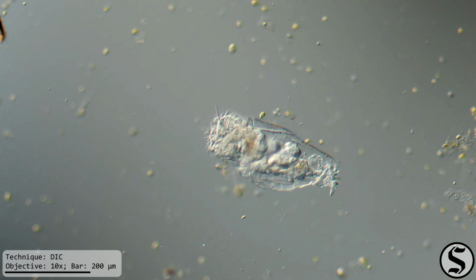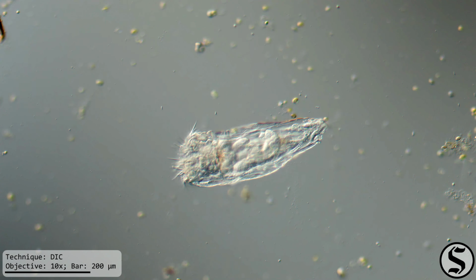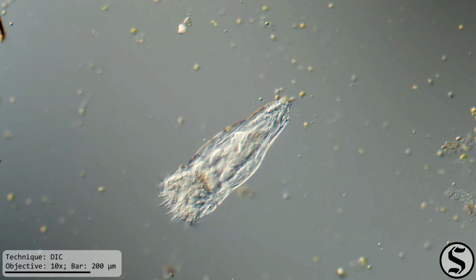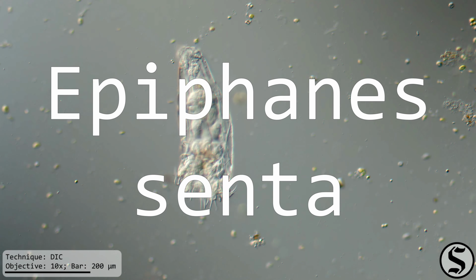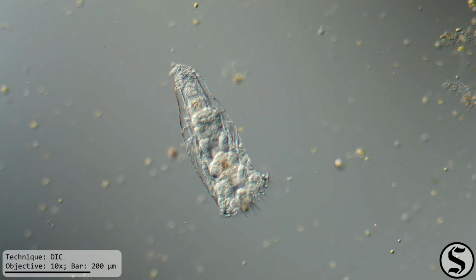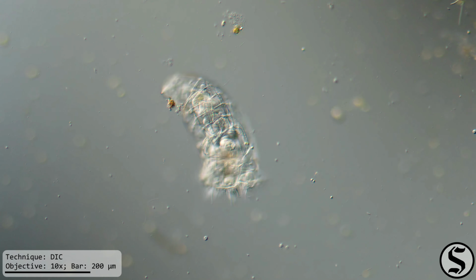And as I was getting ready to take an image of them, because I'd never seen them before, out came this interesting fellow. Now, rotifers as a phylum are no stranger to this bird bath, but I had never seen this before. This appears to be Epiphanes senta, which I'm going to assume comes from the Greek title, meaning the glorious or illustrious. It was an epithet given to a number of rulers.